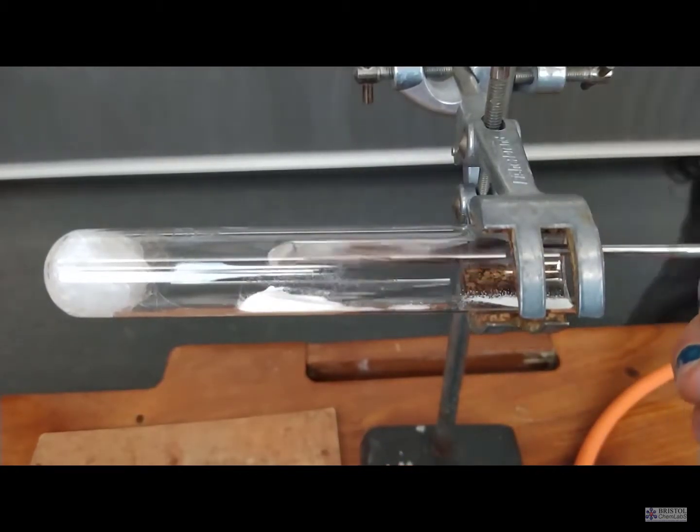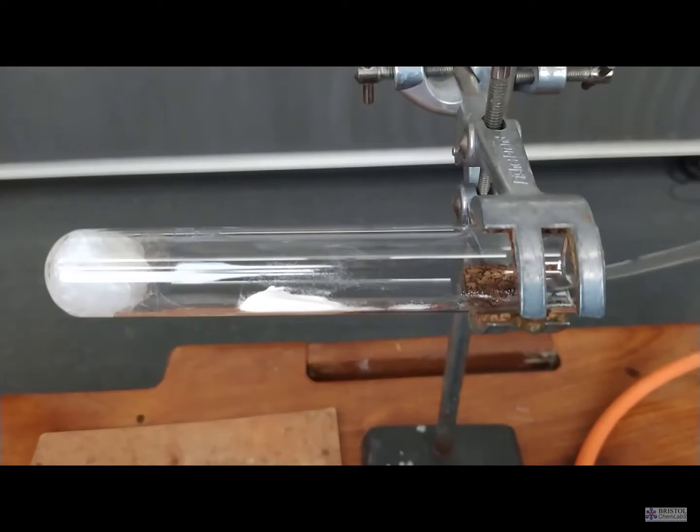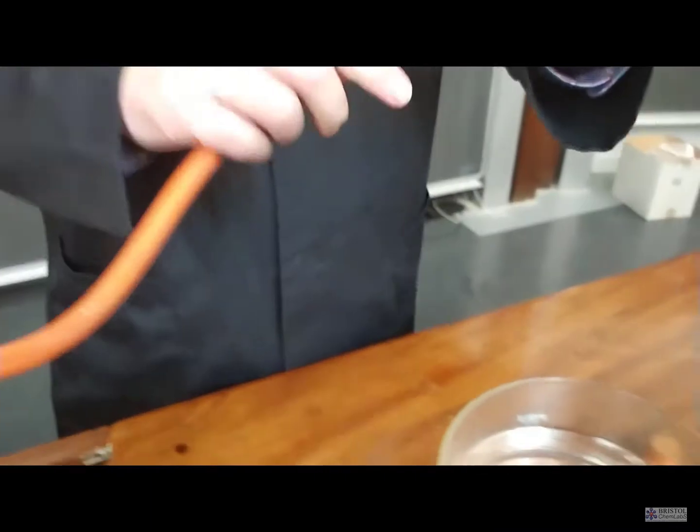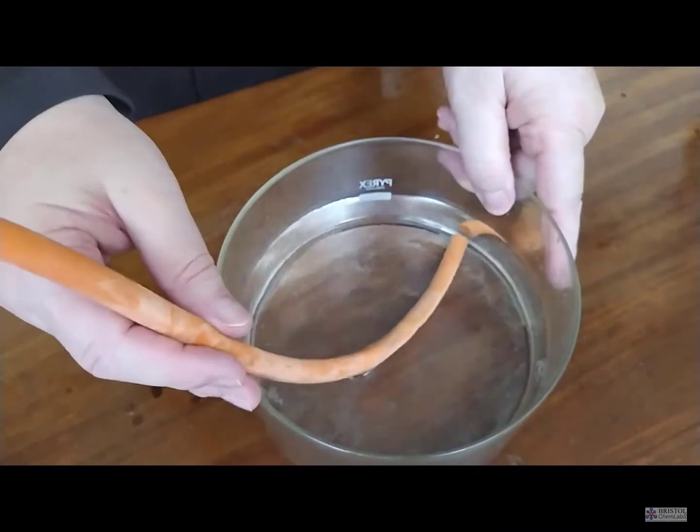And if the students are doing it, they'll need to make sure that they're using a clamp that has full cork coverings, or at least rubber coverings, on all three prongs.